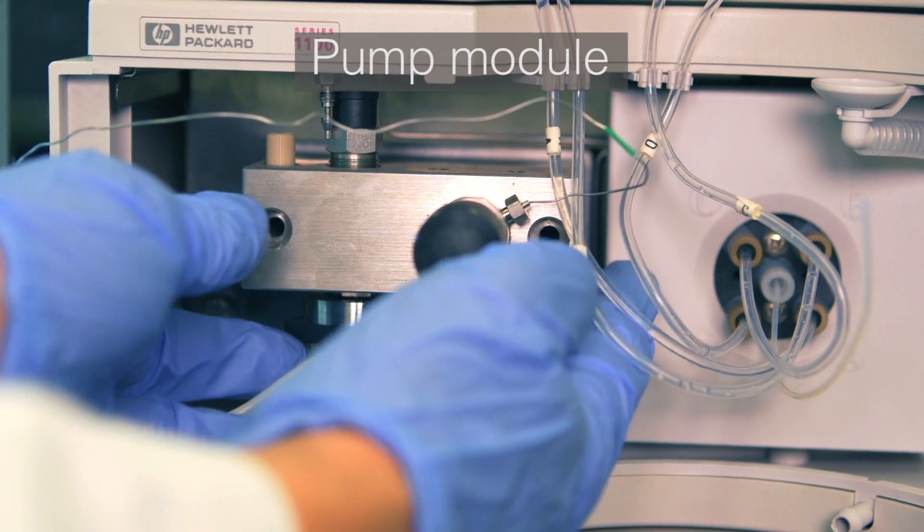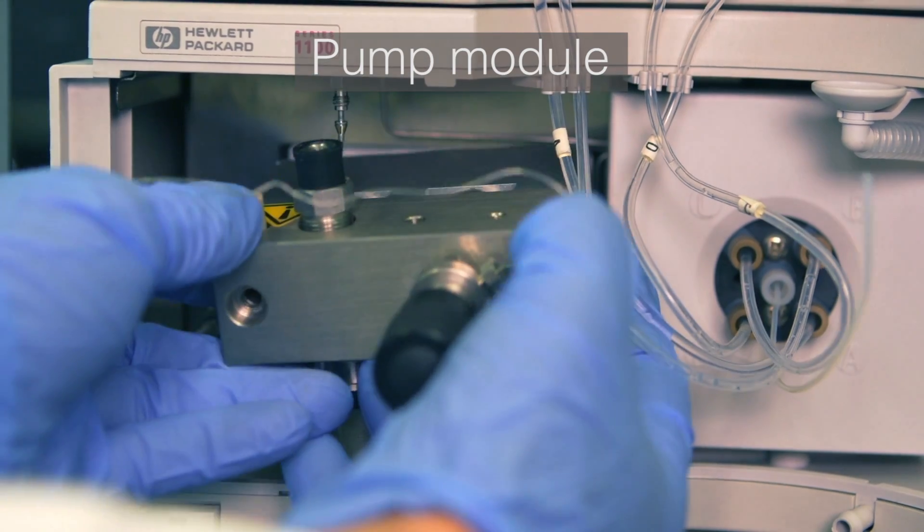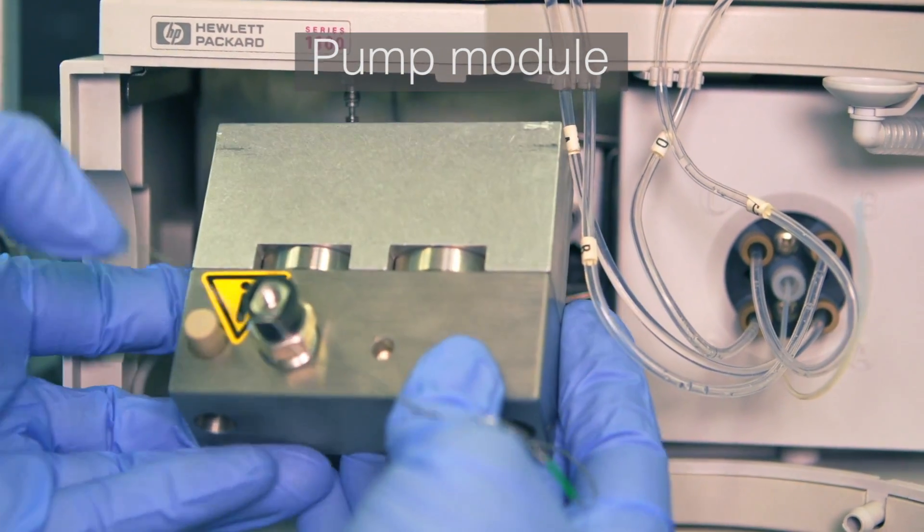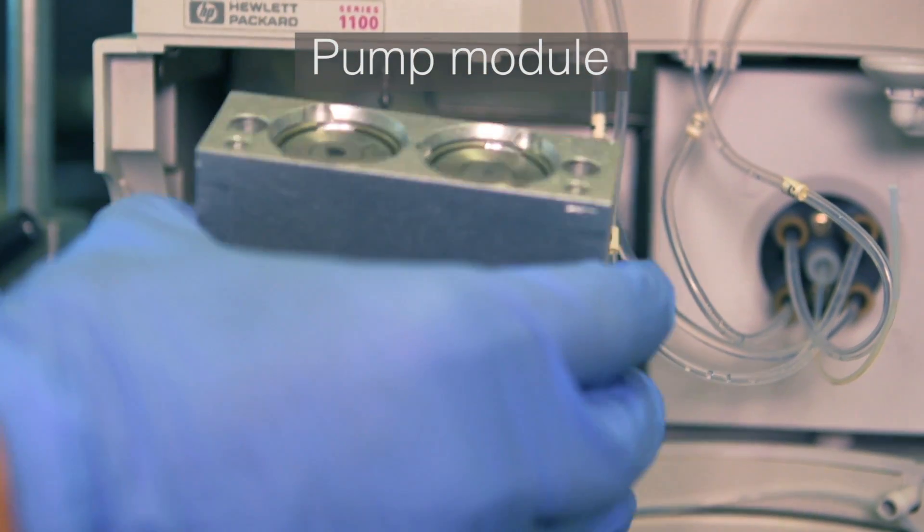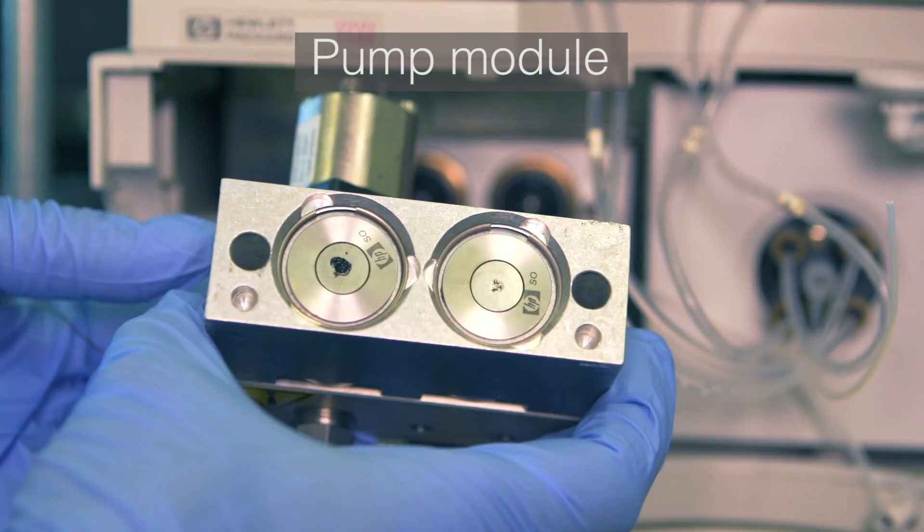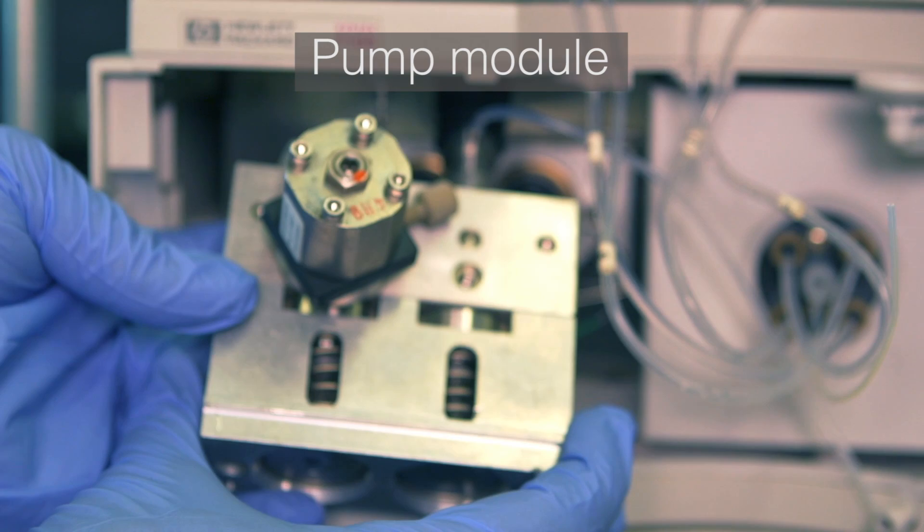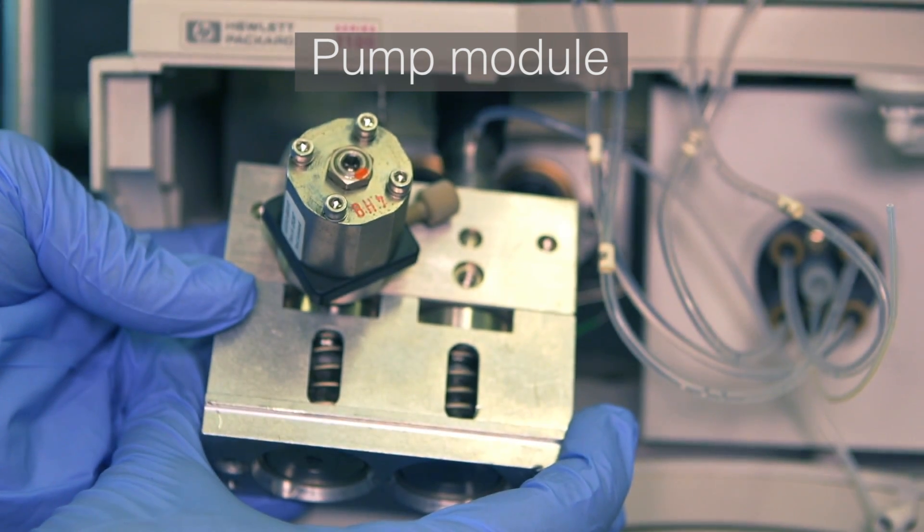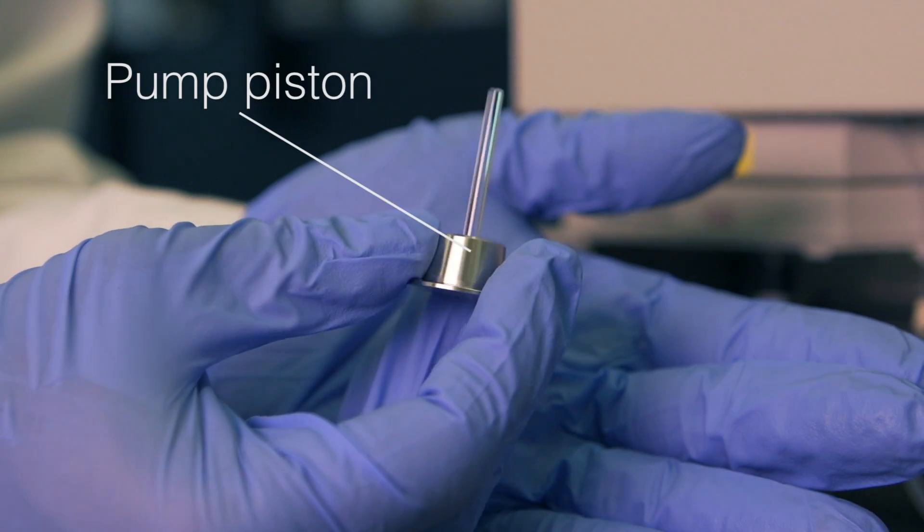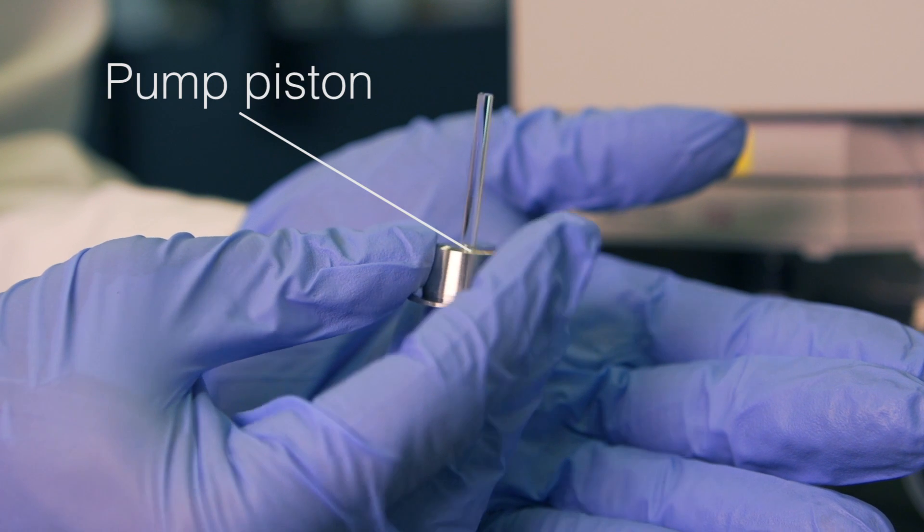A high pressure pump pushes the solvent through the analytical column at a steady flow rate. While the mobile phase is being pumped through the system, the sample is injected into the injector.